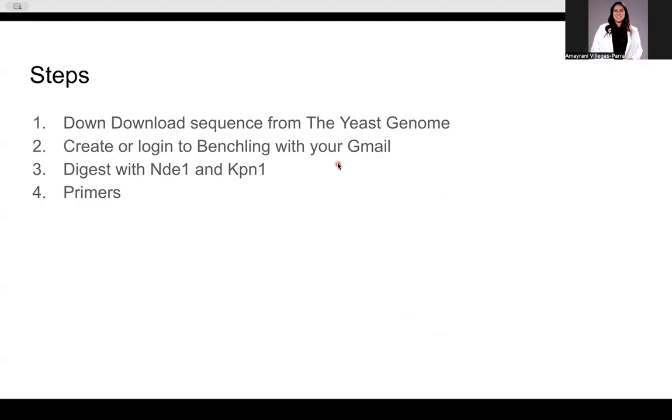In order to do that, I want to start by showing you how we download the sequence, how we create this account online, and then we'll work with the digest. I'll remind you a little bit about the biology of DNA, and then we'll design some primers, okay?